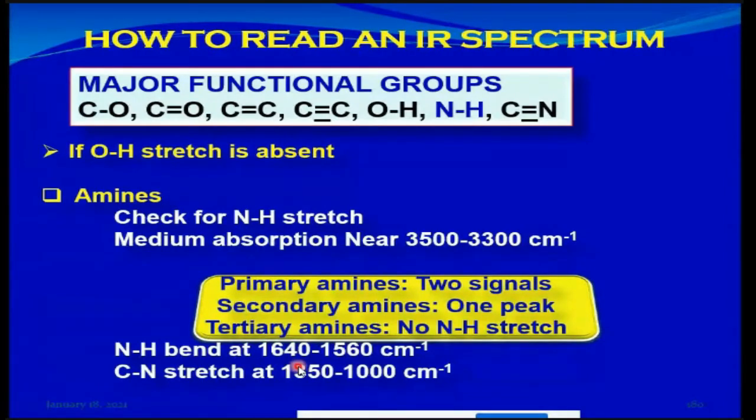ये पीक अगर आपको याद हो तो हम जब एमाइड्स डिस्कस कर रहे थे, तो एमाइड्स में भी आपके पास NH बॉन्ड हो सकता है, और उसमें भी शायद हमने यही डिस्कस किया था। और उसमें जो एमाइड का कार्बोनिल है उसके साथ उसकी जो बेंडिंग वाइब्रेशन है वो कभी कभी ओवरलैप भी हो जाती है 1500 to 1600 per centimeter के रेंज में। And then we have this CN single bond stretch because we have amines, so nitrogen के साथ carbon single bond के जरिए attach हो सकता है, and that will appear around 1000 to 1350 per centimeter. Okay, so these are some of the diagnostic peaks for amines.